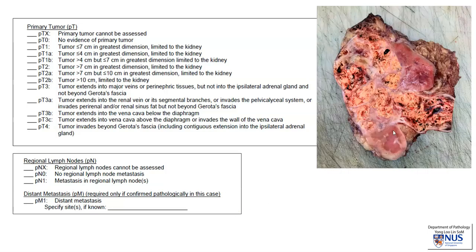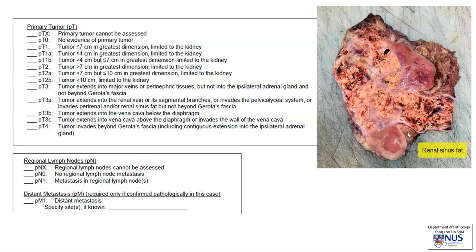In the gross assessment, we can see a tumor in the kidney. To orientate you: this is what's left of the upper pole, this is the region of the renal pelvis, and this is a very large vessel — the renal vein. This little area here is the renal sinus fat, and this is the lower pole of the kidney. This is the capsule of the kidney and the perinephric fat.